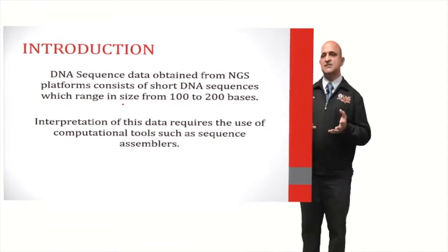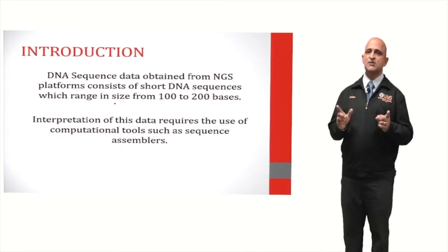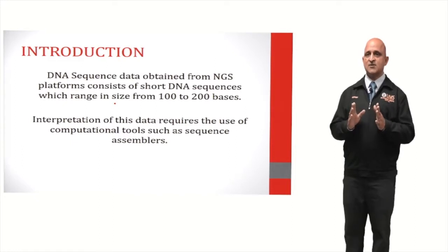So DNA sequence data obtained from NGS platforms consists of short DNA sequences which range in size from 100 to 200 bases. Interpretation of this data requires the use of computational tools such as sequence assemblers.